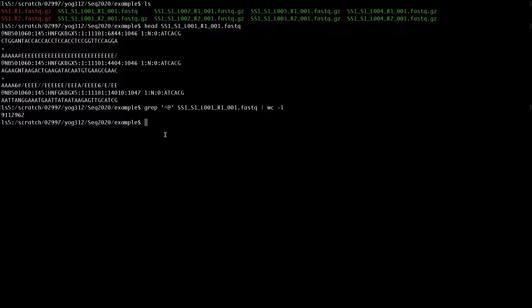And that's how you can find out how many reads you have in your FASTQ file. Thank you.